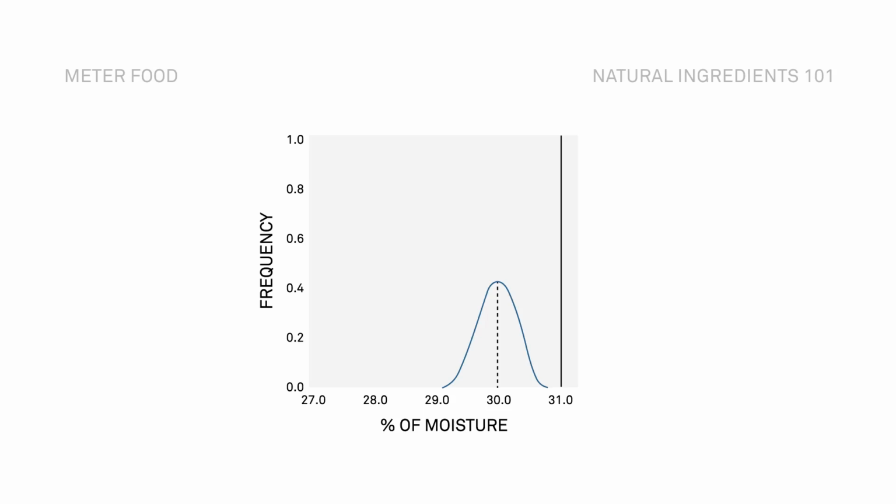So even though we're talking about moisture content, we then turn to water activity and create that isotherm curve to understand how much could we increase the moisture content while keeping the quality and the safety that they want. So by using that isotherm, we saw that they could increase by 0.5% moisture content and also reduce their variation and prevent any of their product from going above 0.7 water activity. So their new target was now 30.5%.